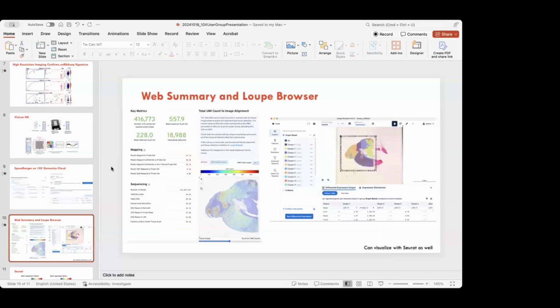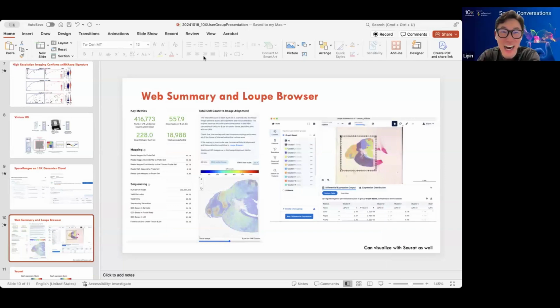It says on the run title, olfactory bulb, Visium HD, on control. Are you working with olfactory bulb in human? No, this is mouse. We're only working in mouse right now. We're developing a therapy, which I unfortunately can't disclose. But we think it's targeted to the olfactory bulb, and so we're using spatial to see if we could detect our therapy or changes that are happening in the olfactory bulb.